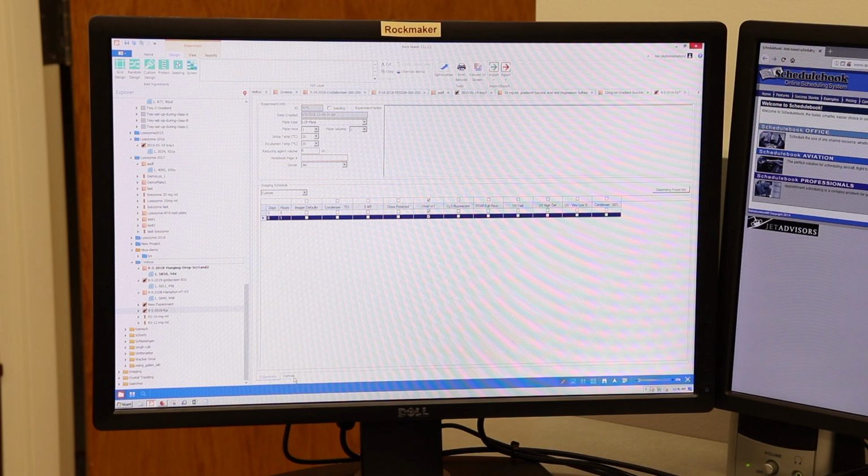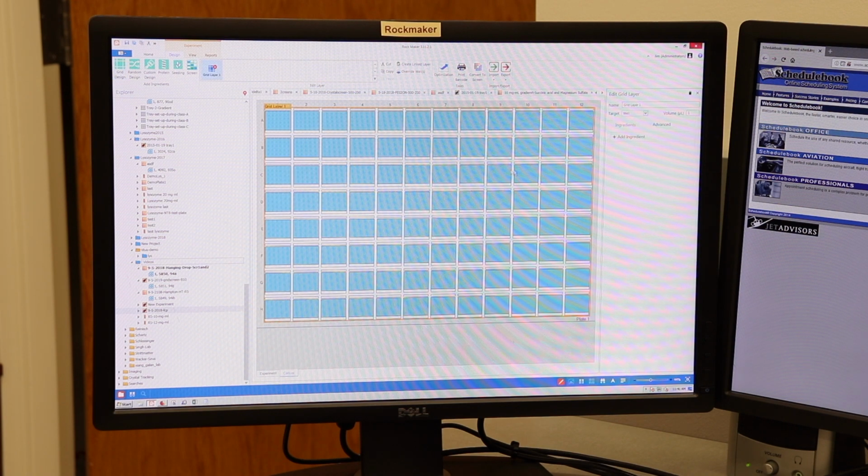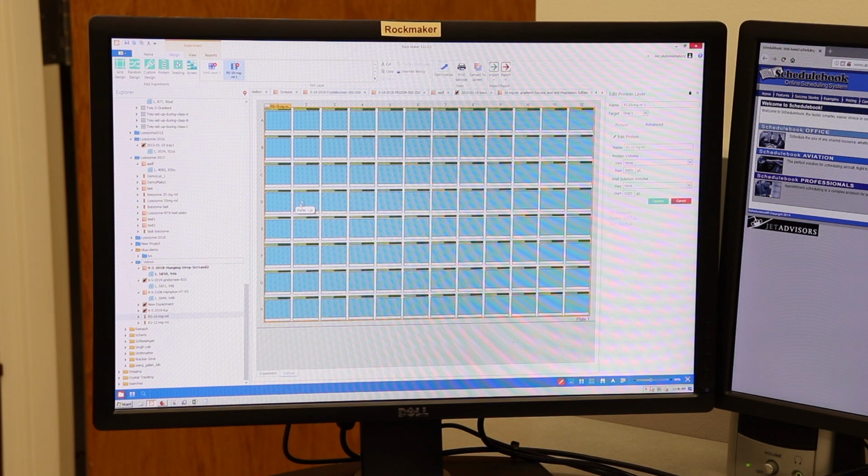Plus on positive hits, that gives you confirmation. So then we want to go to the Canvas tab. Now typically we're not using a commercial screen. We have a recipe that we've created, and it's in our notebook. So in that case, we'll just fill up the wells with the default, basically water, which is a blank. And then we need to pull some protein into the drop here. So that sets our drop up within the computer.